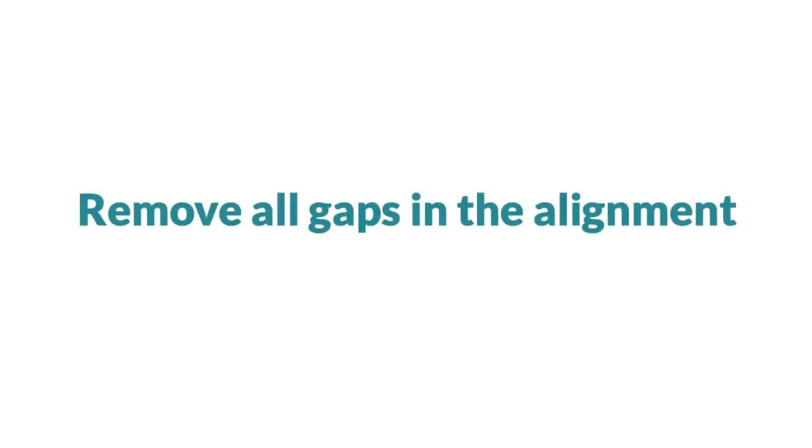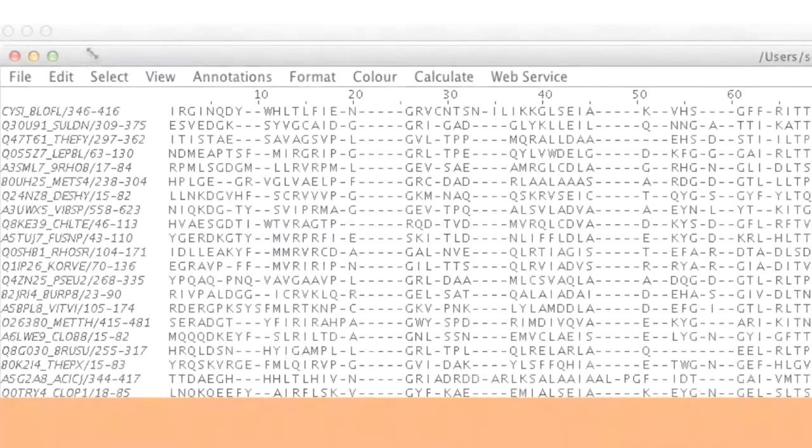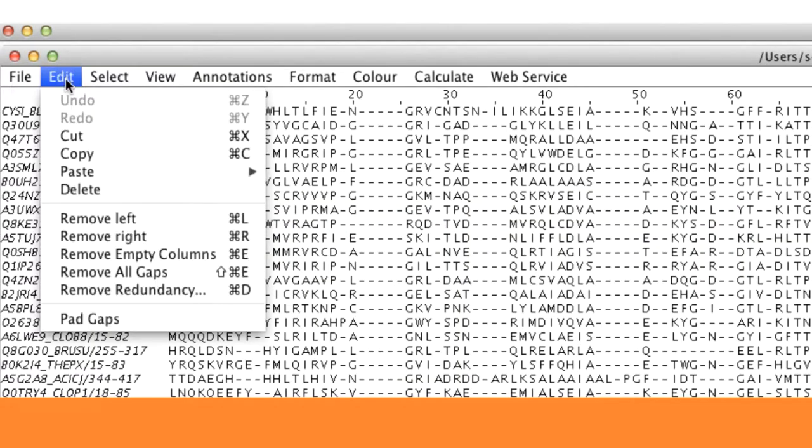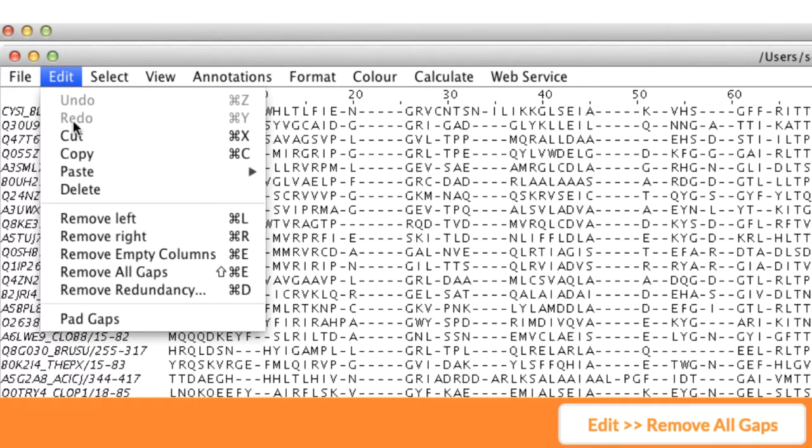Note, all gaps can be removed from an alignment by going to the Edit menu in the alignment window and selecting Remove all gaps.